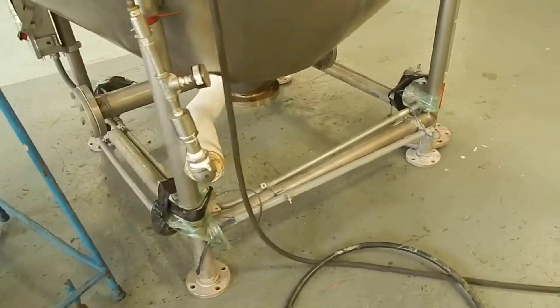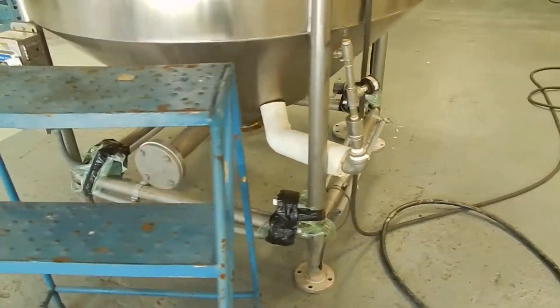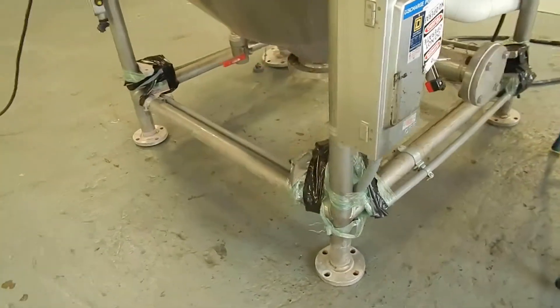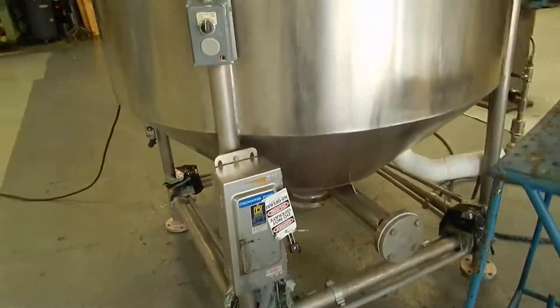Around the bottom of the frame you'll see there are four of the original load cells, which are attached to the frame and will mount on the feet when it's installed, with the readout of course.